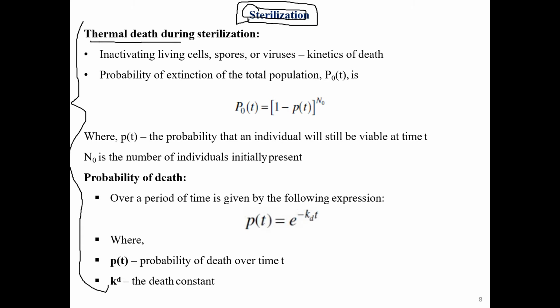Thermal death is basically the death of certain unwanted microbes by providing temperature at a higher rate than normal for a limited period of time. So basically thermal death leads to sterilization by death of microbes. It is basically by inactivating living cells, as said, spores or viruses.